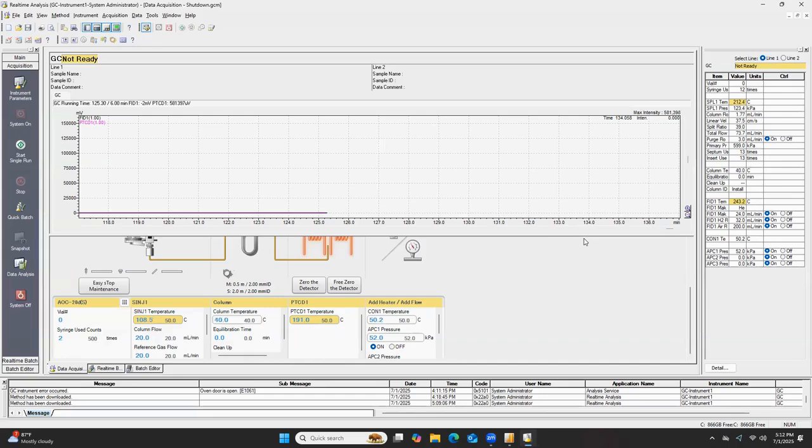So yeah, it was set to 250 or 280 originally, the old method. And like I said, because everything is so hot, we're trying to cool everything down to an almost touchable temperature, basically. So that's why the waiting period can change from 30 minutes to an hour, depending on how hot everything is set to.